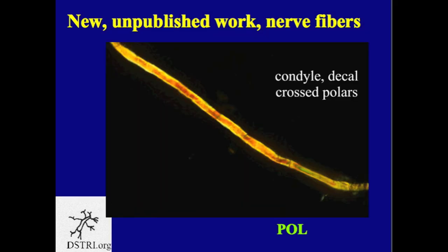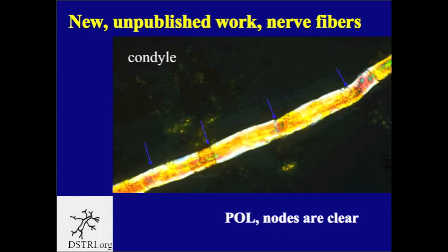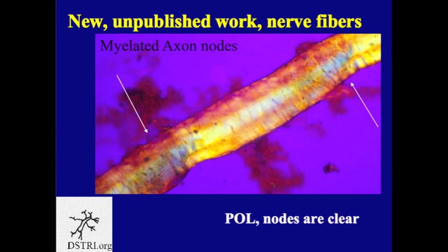Here now is a longer and more intact nerve fiber collected from the Triceratops condyle, removed through decalcification. Simply under crossed polars at extinction you can see beautiful birefringence, and you're beginning to see the banding across the nerve fiber. At higher magnification, the crimping nodes that crimp the myelin sheath to the axon fiber become clear — we're looking at a myelinated axon released through decalcification from a Triceratops condyle with clear nodes running up and down the fiber. At an even higher magnification we can clearly see the axon traveling down the center of the fiber.